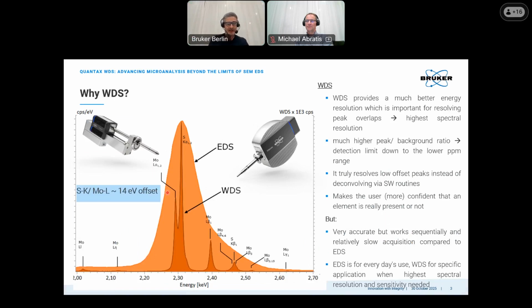So now let's get started. Over the last couple of years, deconvolution routines for EDS have been significantly improved. So a relevant question for many users is whether they still need a WDS or the single EDS detector might be enough for their applications. This webinar will showcase application examples that go beyond the limits of EDS, emphasizing the importance of having a WDS to complement EDS for challenging applications.